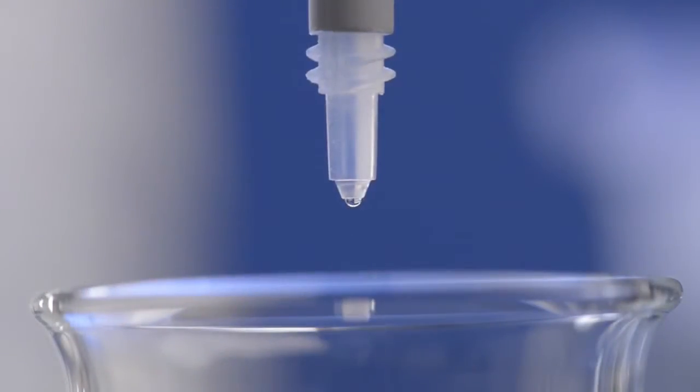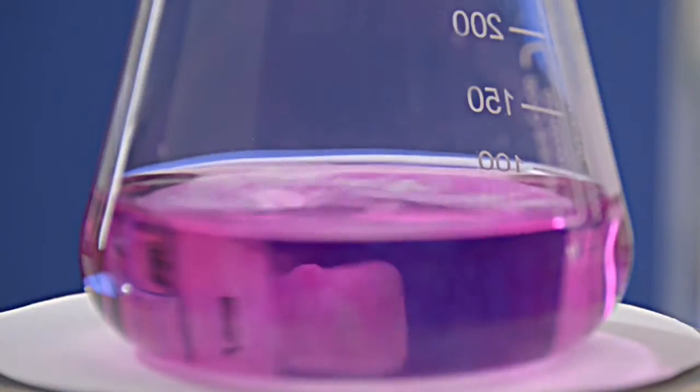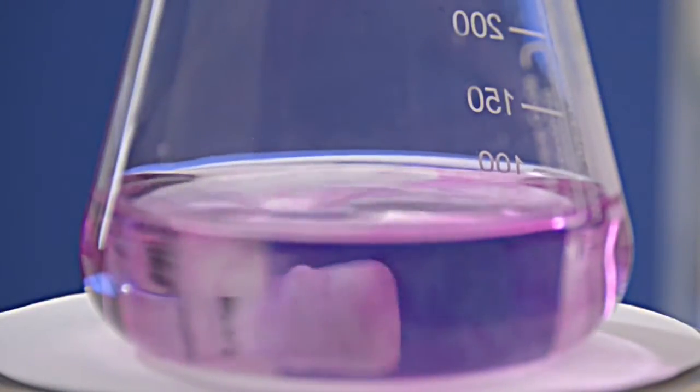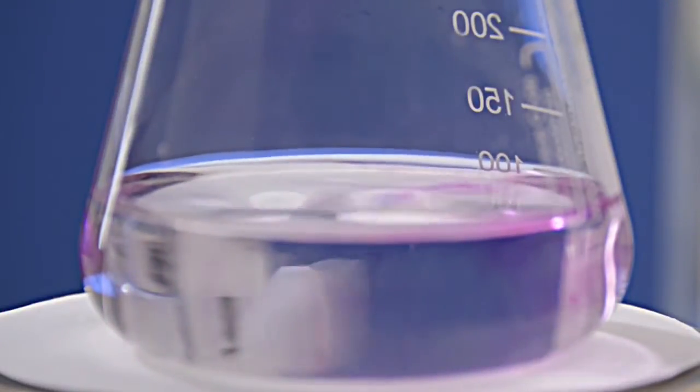Determining the end point, drop by drop, if necessary even to three decimal places. No problem for the Titrate! Using it, you can titrate quickly and reliably within the error limits of Class A.